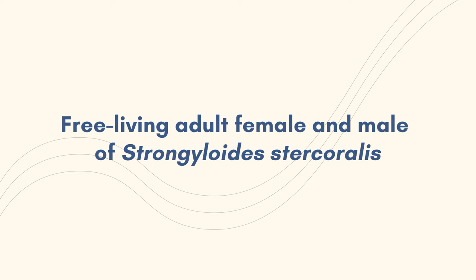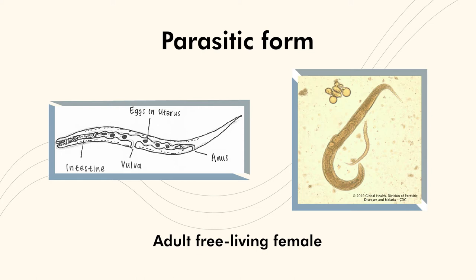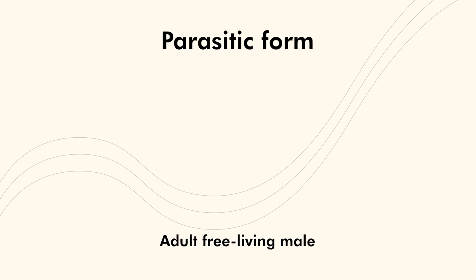The free-living form includes both female and male adult Strongyloides stercoralis. The free-living adult stages are approximately 1 mm in length, with the female slightly larger than the male. Free-living female nematodes have uterine at the posterior end of the nematode containing more eggs than the parasitic females, which have their uterine located more equatorially.